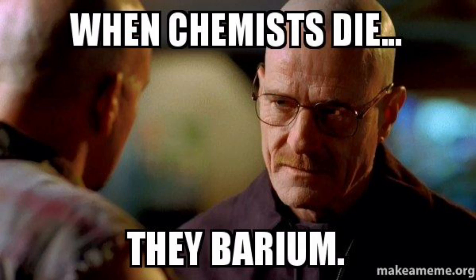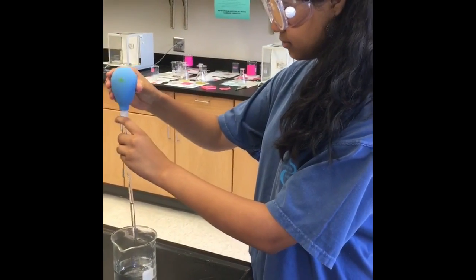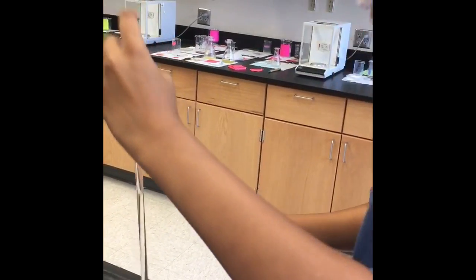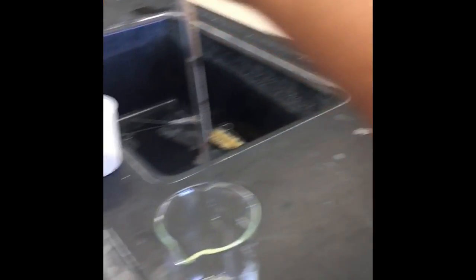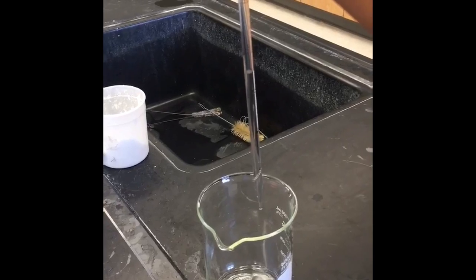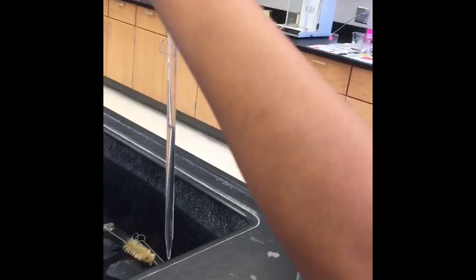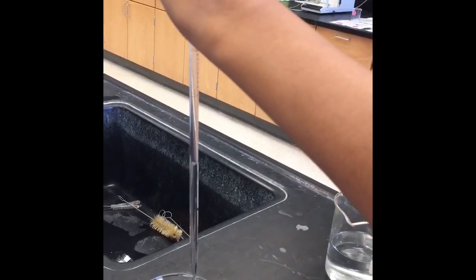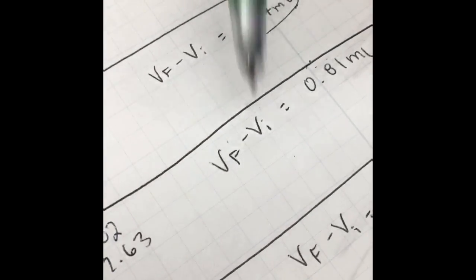Now let's see how Deepa conducts the experiment. The initial volume is 1.82. Ready? The final volume is 2.63. This is the transfer volume, 0.81 milliliters. We found this by subtracting the final minus the initial.